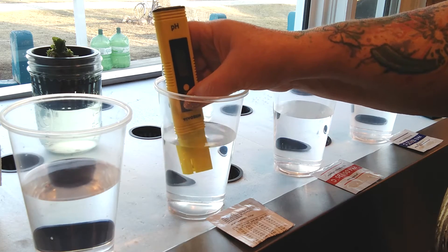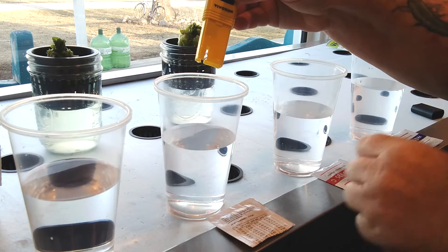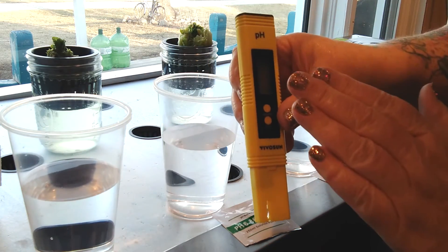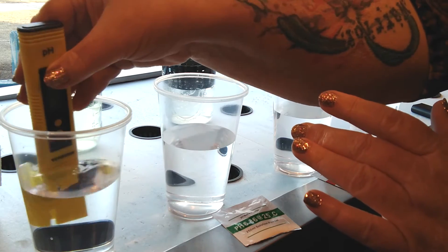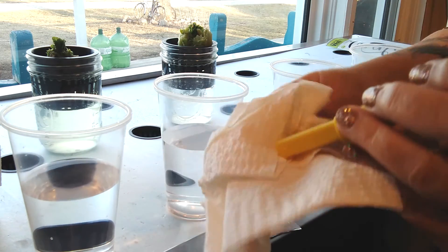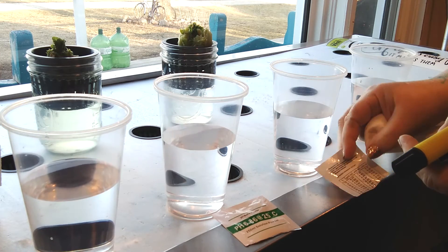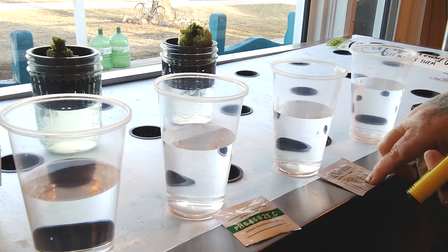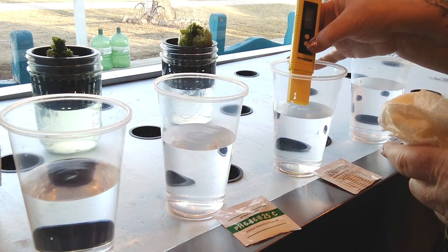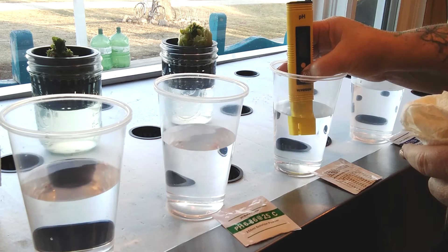At 20 degrees Celsius we're going to be looking for a 6.88 result. You see two buttons — the top one is your on/off and the bottom one is to calibrate. We're going to put this in the water and press the calibrate button for five seconds. It says 'end.' It said 6.87, so it was very very close to the 6.88. Do not turn your unit off. Now we're going to rinse it in our distilled water and lightly dry it off.